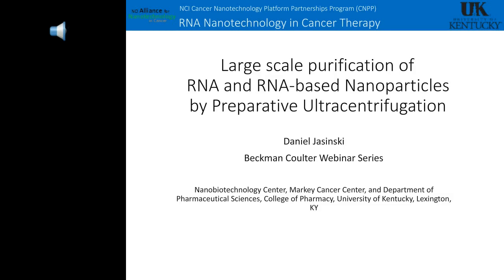The next question relating to RNA purification is, which method do you most commonly use? Is it electrophoresis? A lot of people use PAGE gels. Chromatography, size exclusion, or ion exchange, ultracentrifugation, which is today's topic, organic extraction, or I have never purified RNA. Just a few more moments. It looks like 43% have never purified RNA, 28% use organic extraction, 17.9% use electrophoresis, 7% chromatography, and 3% ultracentrifugation. So we can definitely present our results of ultracentrifugation here and hopefully skew you in that direction.